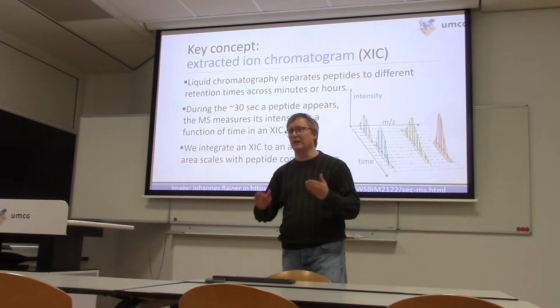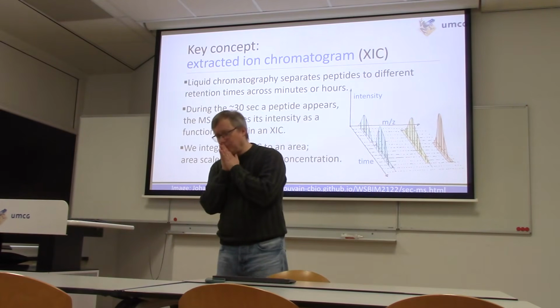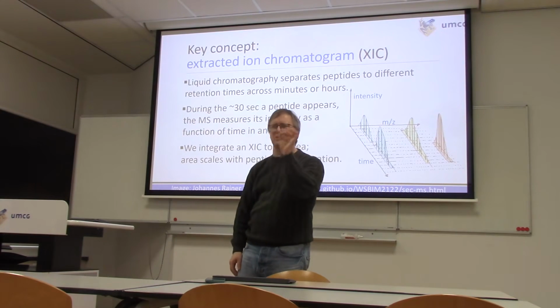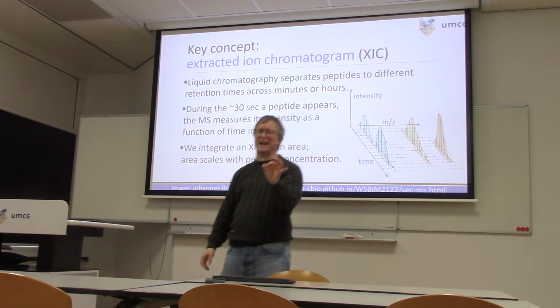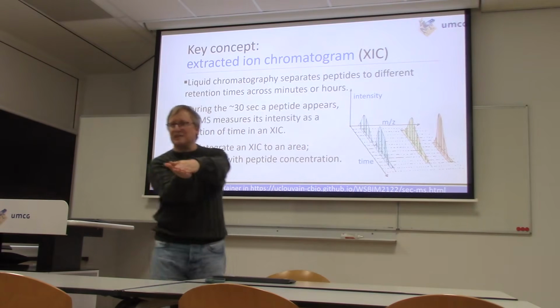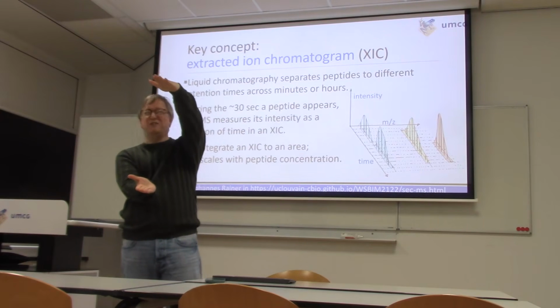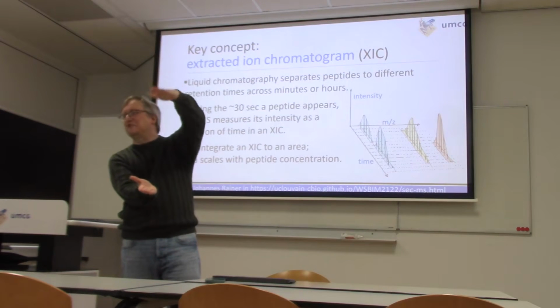about quantitating in proteomics. One of the little jokes mass spectrometrists tell on themselves is that we are masters of the x-axis. We can tell you the mass of things and the mass to charge of things very, very accurately. But as soon as it comes to those intensity values, things get a little hinky quickly. Those numbers can bounce around quite a lot.